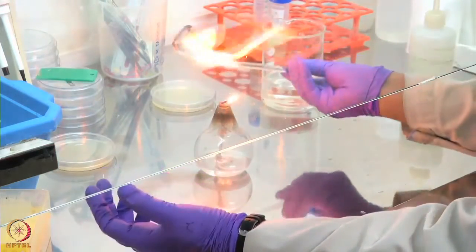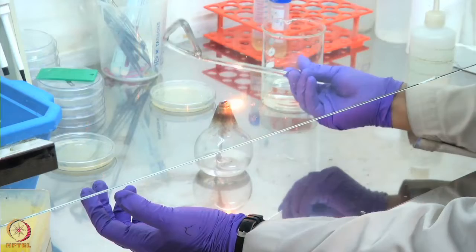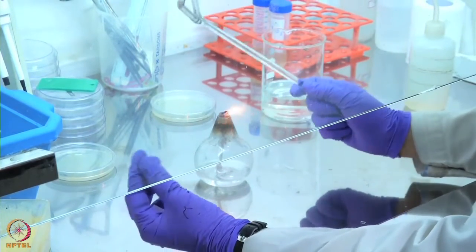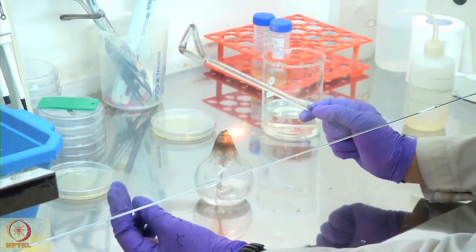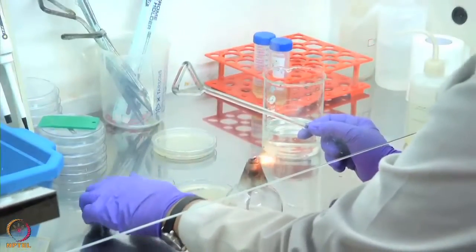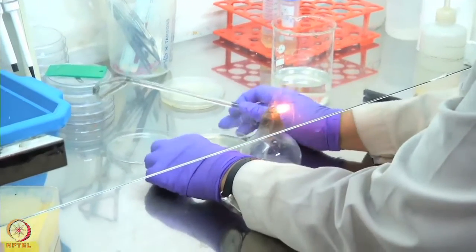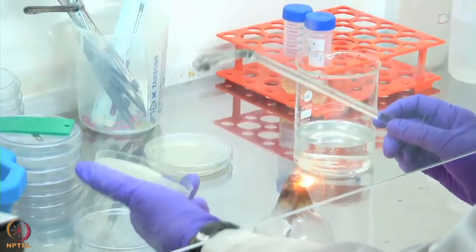I will show my spreader flame. I will wait for a few seconds for the spreader's temperature to come down. This is how my plate looks.